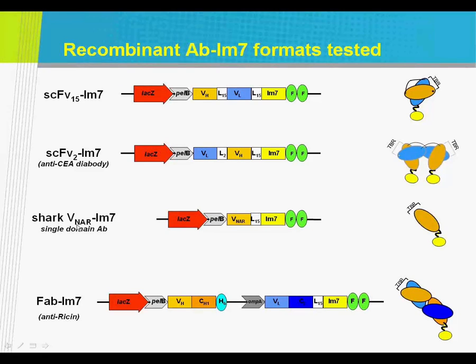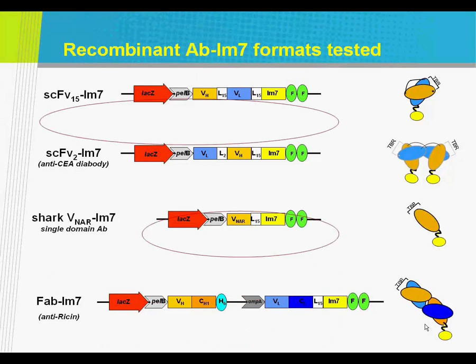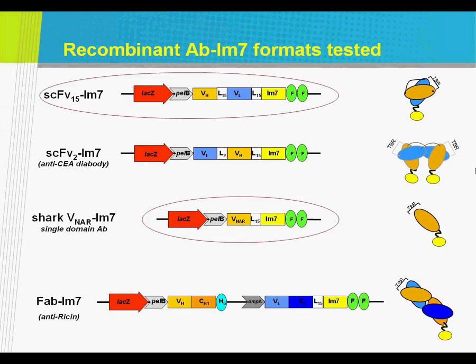So, okay, again, this was developed before we had access to ProteOn, so this shows the BIAcore data. Now, we'll go through this fairly slowly because it's quite a complicated slide. There are 40 overlapping cycles shown here. Each cycle consists of injection or capture of recombinant antibody fragment onto the DNase E7 coated chip. So that's in this part shown here.